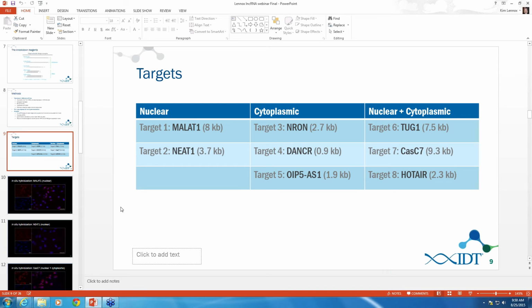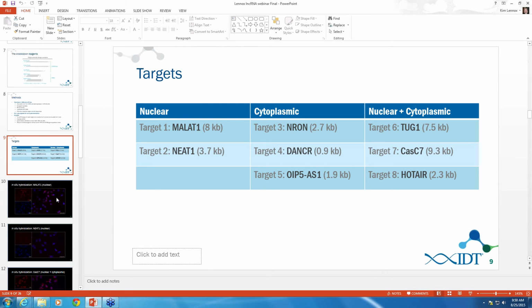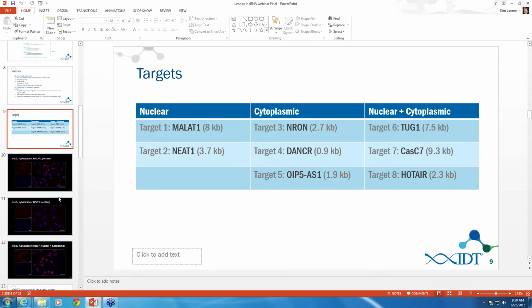and he showed very convincing data that MALAT1 was able to be knocked down both in the cytoplasmic fractions as well as in the nuclear fractions, and also showed in situ hybridization data after knockdown with an siRNA that MALAT1 disappeared. And so we appreciated that going into the study, and that wasn't really the objective of the study, which was to prove that it was in the nucleus or not in the nucleus. We just kind of wanted to give an overview as if you had to choose a method of knockdown, which one would you choose to have the higher level of success?